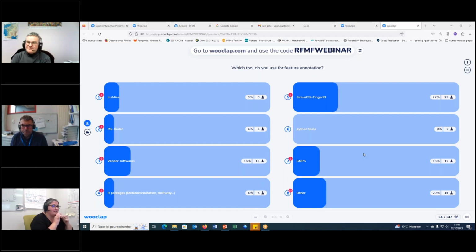I would say the very first starter pack is to do that manually and to understand what you are doing, because it's a joke, but not really. Being able to give the right annotations to an ion, so find the right adduct we are looking at, the nature of the ion we are looking, and have a look at MSMS spectra manually, and be able to see if the quality is okay before going to databases, external or internal.